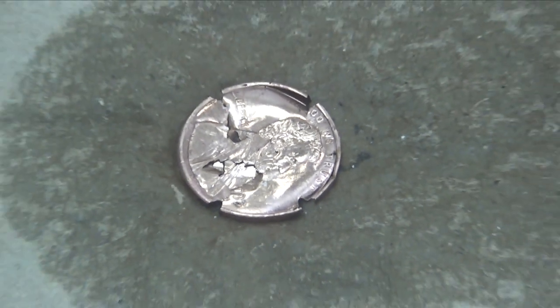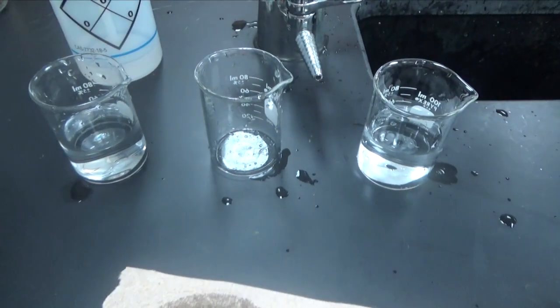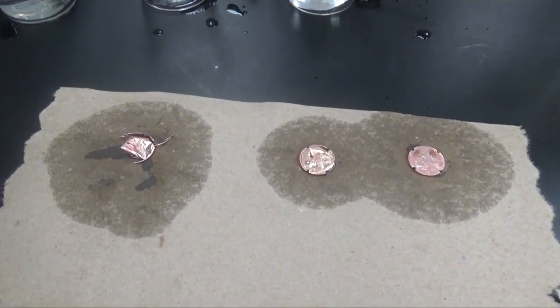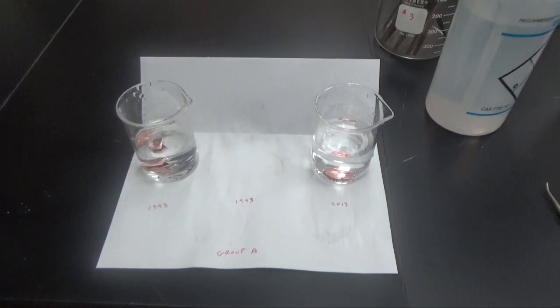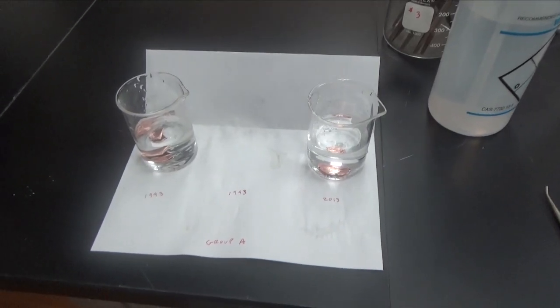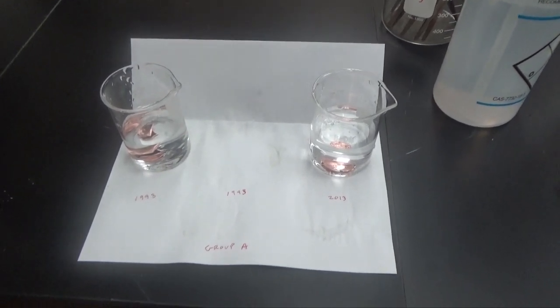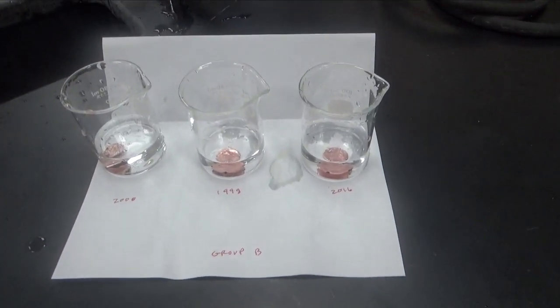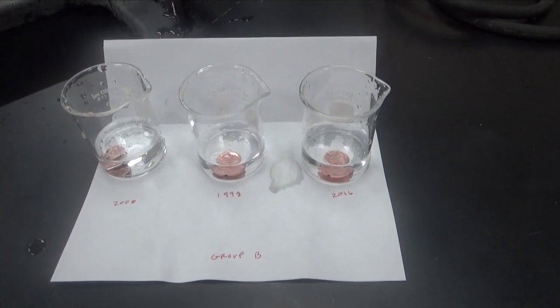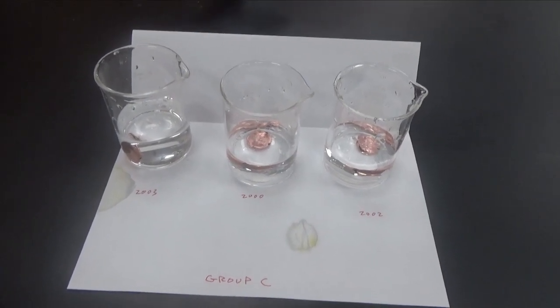The other pennies for all the groups are going to go into some distilled water beakers for a few minutes to completely neutralize the acid. So all of the pennies from group A are in distilled water, except for the middle one. It is in the fume hood under acid. All of the pennies from group B are in distilled water for a little bit, and all of the pennies from group C are in distilled water for a little bit.